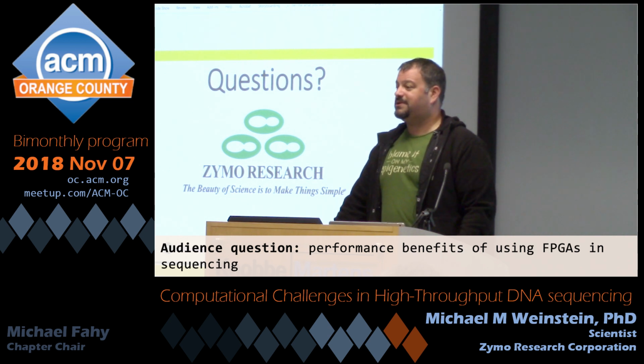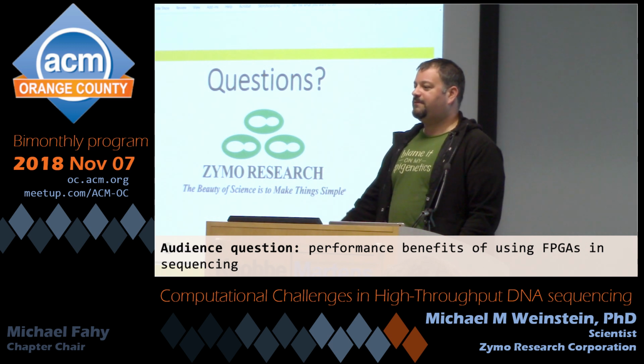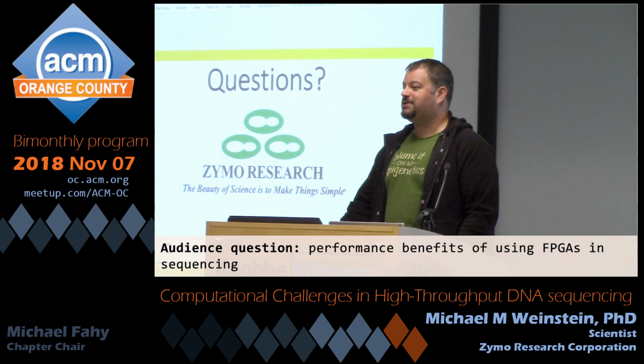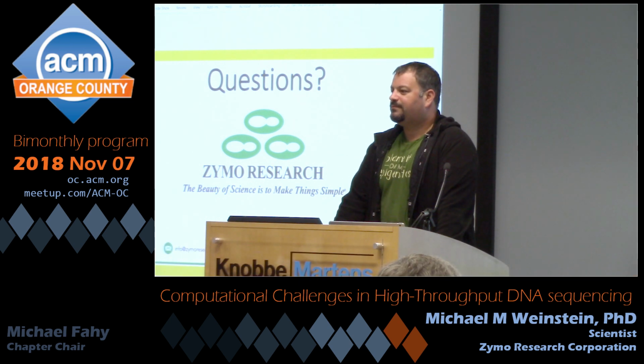They've gotten huge amounts of alignment and sequence analysis and variant calling done in a very short amount of time using their FPGA, including approaching some of the stuff I talked about earlier, where a sick child comes into the hospital with a suspected genetic disease. I think this happened down at Rady Hospital. And I believe using a combination of very fast sequencers and that platform, they got to a genetic diagnosis within like 24 to 48 hours. Which, even when I first started my human genetics PhD, was almost unimaginable. So how about the quantum computer?